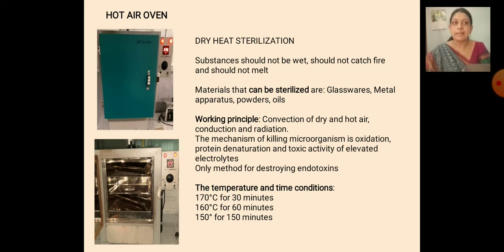What is sterilization? Sterilization means keeping all equipment and apparatus free from contamination by killing the microorganisms, especially the bacteria and the fungi that may grow. It is very much required because whatever study we do in the practical process should be contamination free.